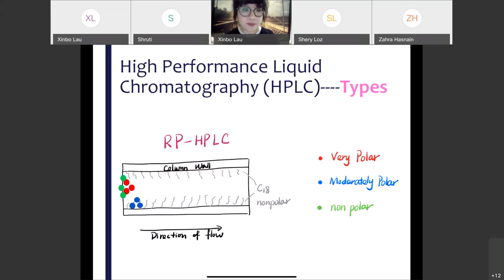Okay, so I'll say one more time. You have the non-polar stationary phase, and the working principle is that when they have similar properties, they have stronger interactions. If they have similar properties, they have stronger interaction, and they're going to stay on the column longer. The red one doesn't have similar properties; the green one is going to stay longer.